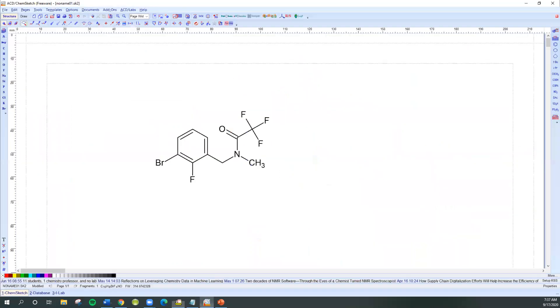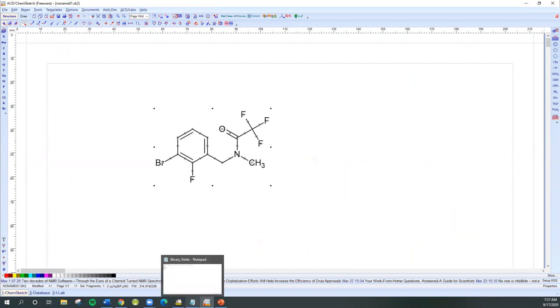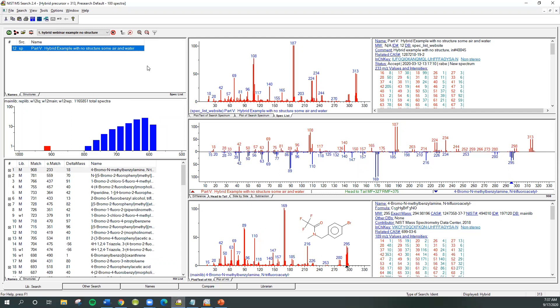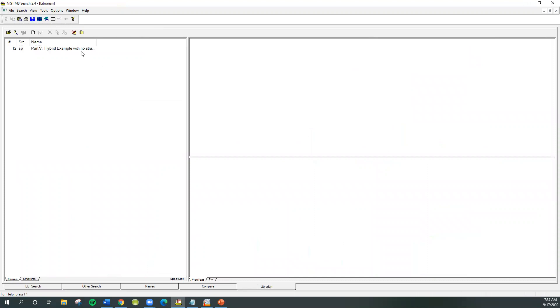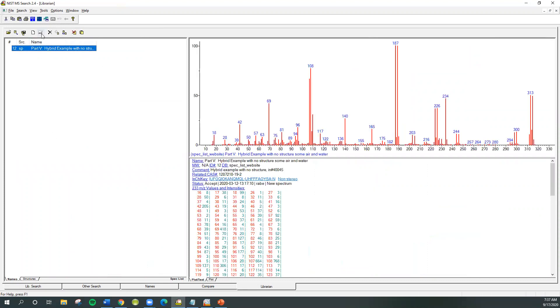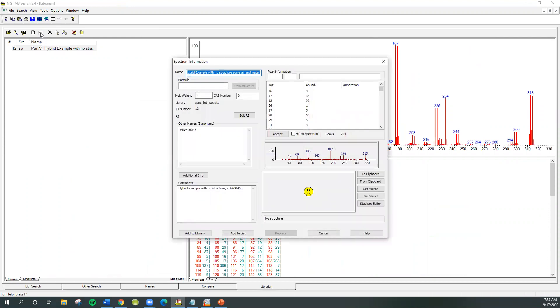We'll go to our structure drawing program. I've already drawn the structure here — we'll need to select it. You can either circle it or just click on it, but select the structure you want and say Edit > Copy, and that puts it in the Windows clipboard so it's ready to go over and be placed inside the NIST software. What we want to do is make this correspond with this spectrum, so if you look at the bottom you have to go to the Librarian tab. Select it so it's highlighted — left mouse click on it — and then go to the Edit button. If you hover here it'll say 'Edit Spectrum.' We put it in the clipboard, so all you have to do is say 'From Clipboard' and it'll bring the structure into focus.